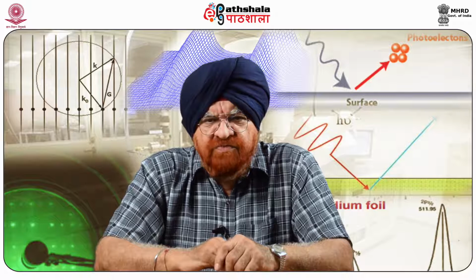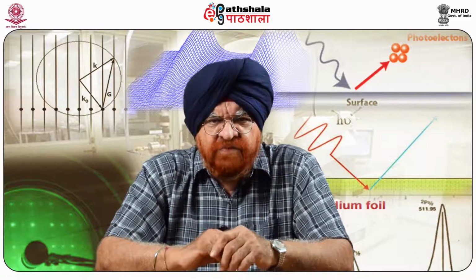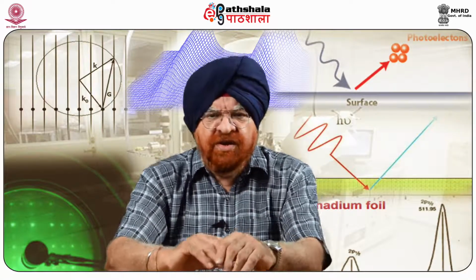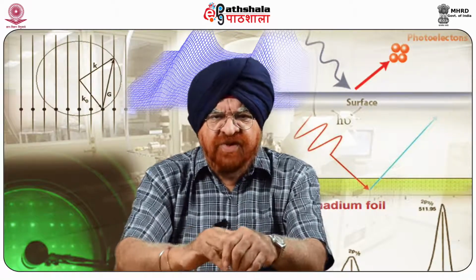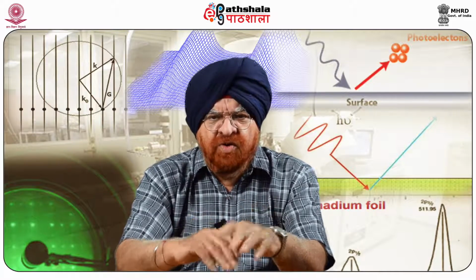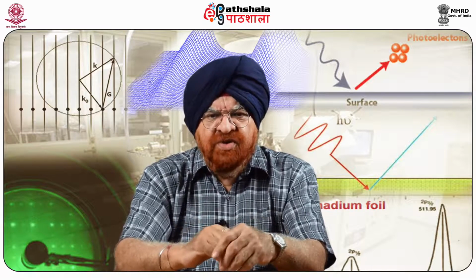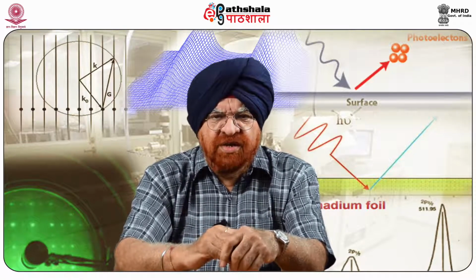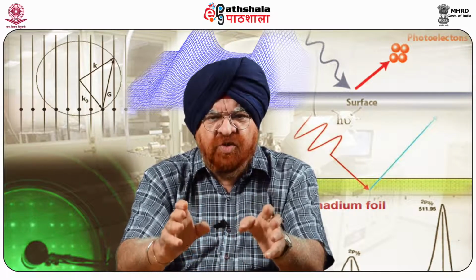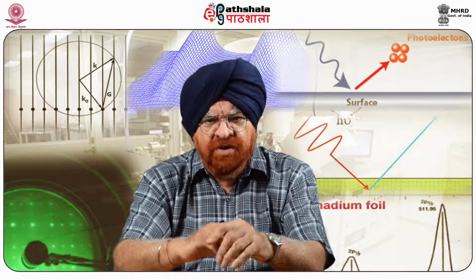Well, when we look at the kind of potential which has to be given at the tip, or the conditions that are to be maintained for getting the right kind of images, one has to have independent control of the potentials of both tip and substrate with respect to the RE, which allows various modes of current-voltage spectroscopy in an electrochemical environment. That's important.